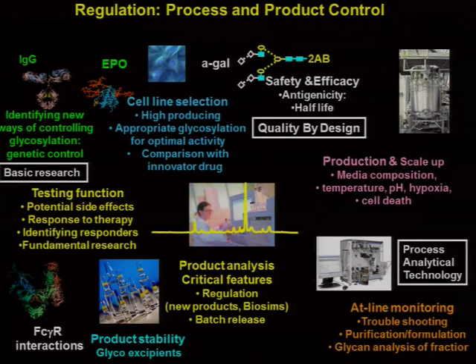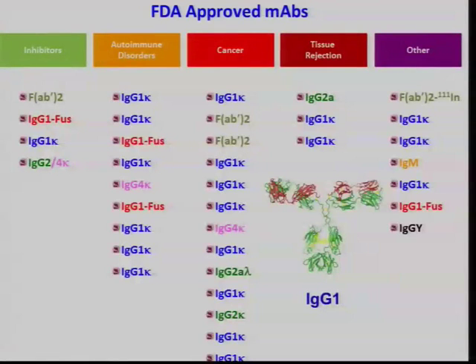in your final product. And so in the first part of the talk, I'm going to talk about IgG, then I'm going to talk about erythropoietin, and then I'm going to talk about etanercept, because those molecules increase in complexity of glycan analysis. So we'll just see how far we get. But please ask questions. So is everyone okay so far?